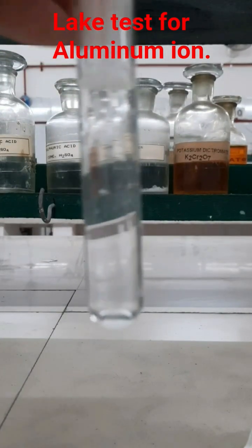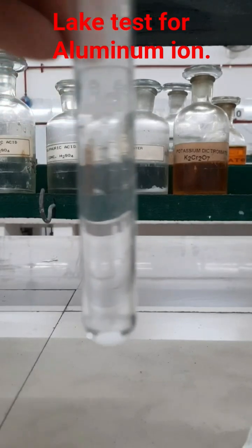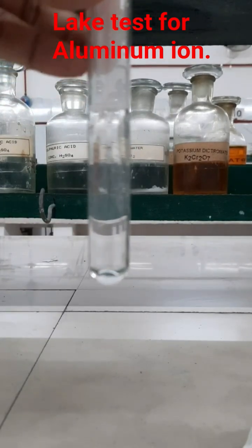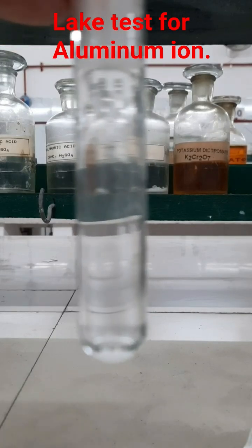Then you have to add a few drops of blue litmus solution into it. The color of the blue litmus solution will turn red since the medium is acidic due to the addition of dilute HCl for dissolving the precipitate.